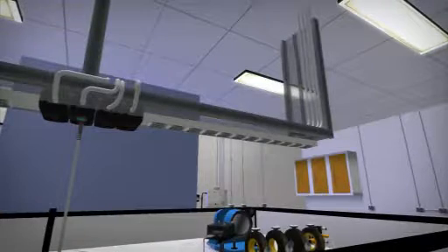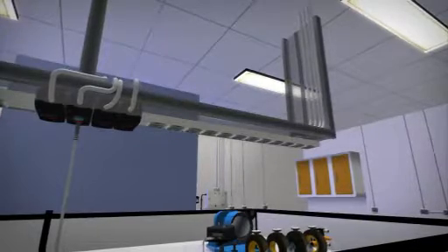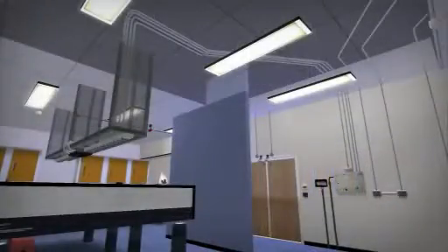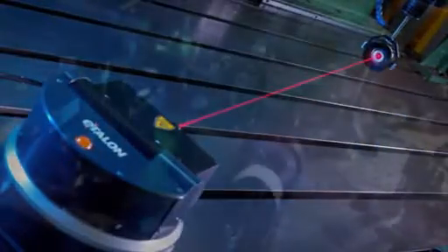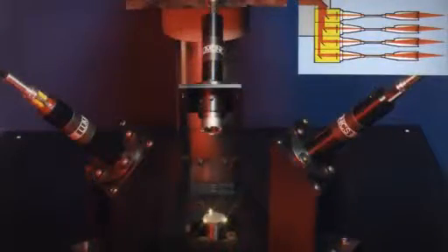If we were to follow the cabling path around the room, we would see how the remote interlock plugs connect up through the gantry, along the ceilings and walls, to the interlock control box. There are many types of lasers which span the visible spectrum and go beyond into the ultraviolet and infrared. The hazard changes as the power or energy increases, and also if the output is pulsed or continuous.